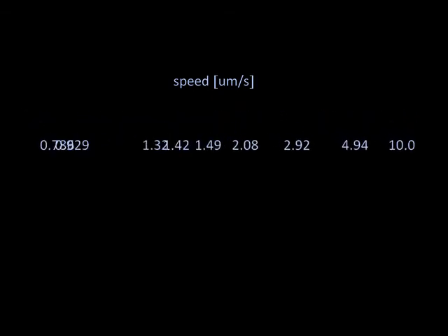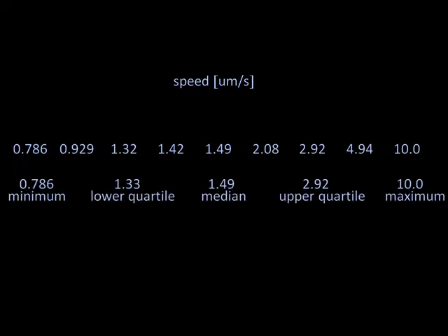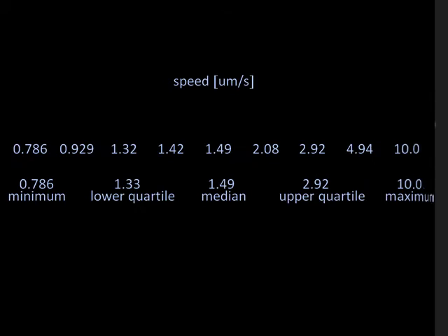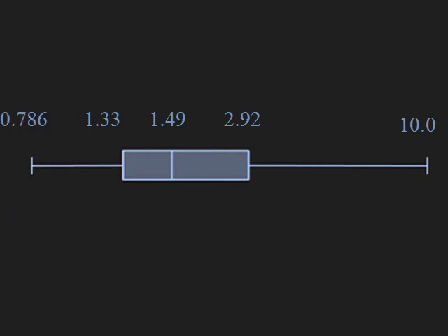When the Show Box Plots option is selected, ImarisVantage automatically orders all values of the selected variables from the smallest to the largest. Then it determines the maximum and minimum, median, and important percentiles. Based on these calculations, the box plots are set up.